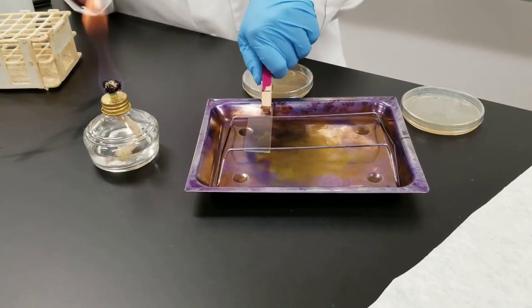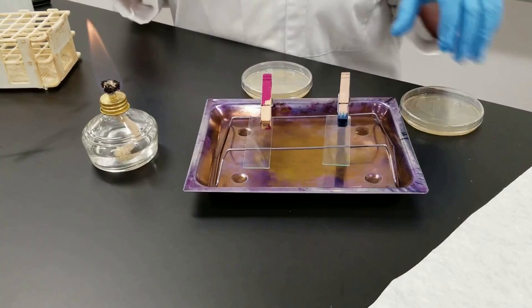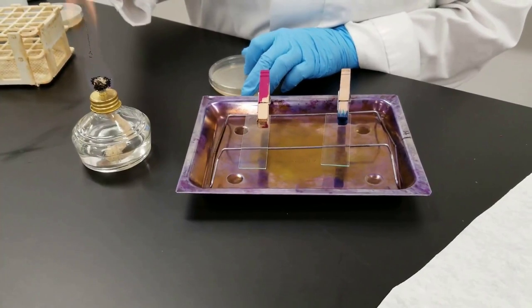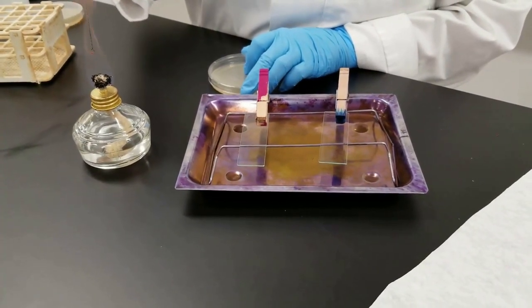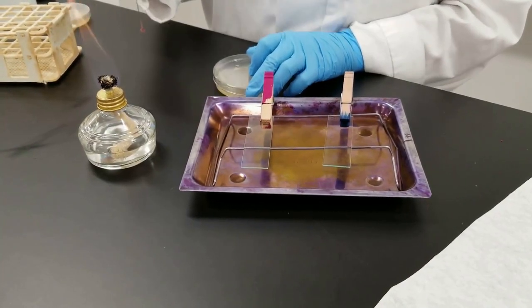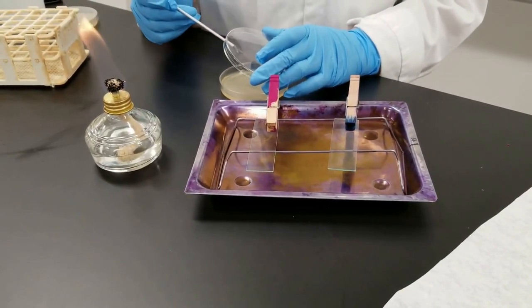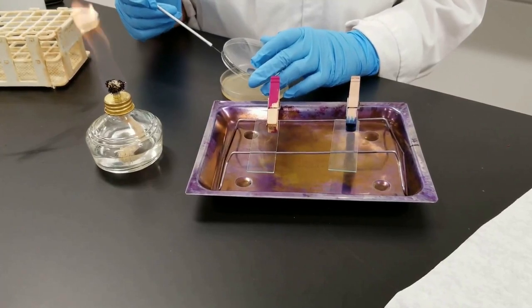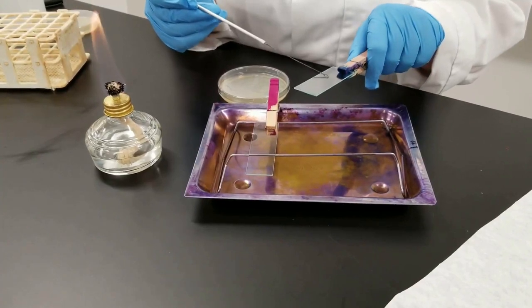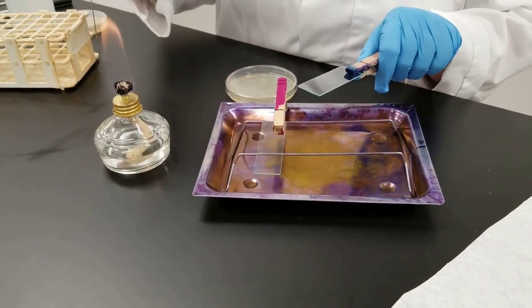I'm going to let it sit while I now prepare my second slide, which is going to be E. coli. Flame my loop. I'm taking these cultures off a petri dish, so I'm coming off a solid medium. You could be coming off of a test tube from a liquid medium. Remember, always be working near your flame. So now I'm taking some of the E. coli, just like I did with the Staphylococcus aureus, I'm going to smear it on here, flame my loop when I'm done.